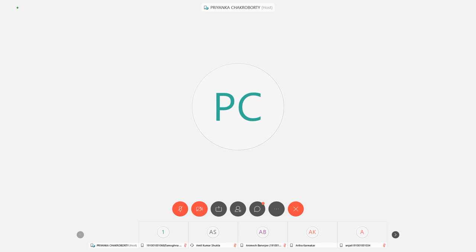So in lab we prefer to do the Fehling's solution test because that is a more available reagent in the lab. In Tollens reagent we need alkaline AgNO3 solution. That is a costlier solution.